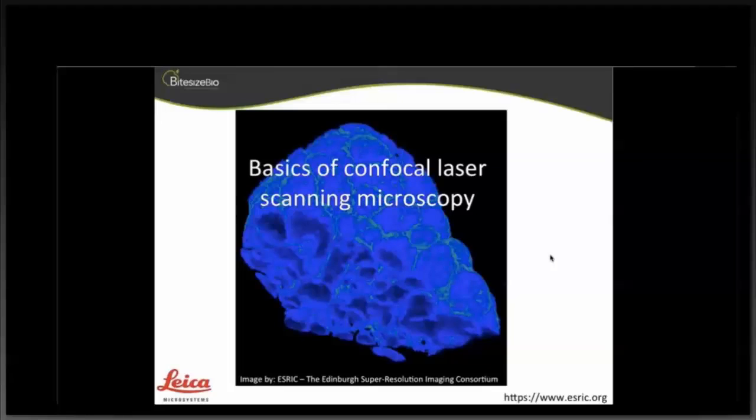It's a tunable laser, and you can use it at an excitation between 470 and 700. So I think that I might need to give a bit more of an in-depth answer online. Okay, that's not a problem.